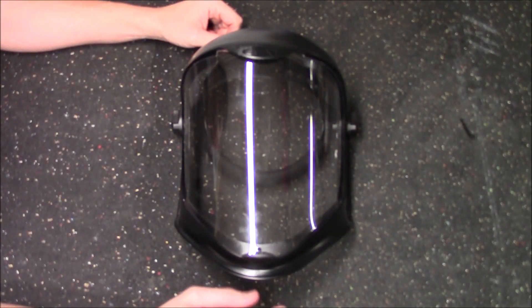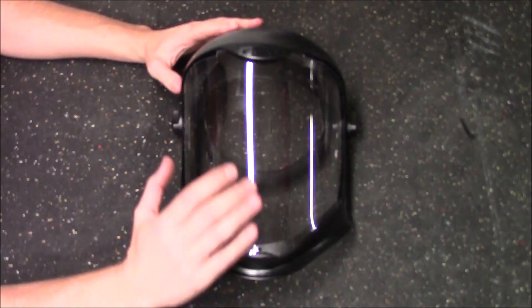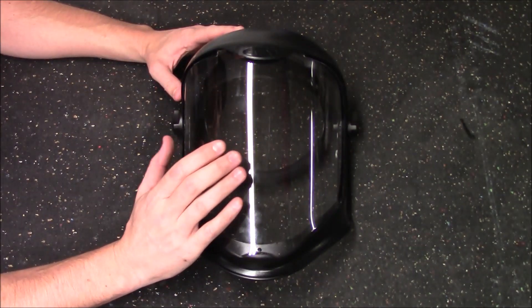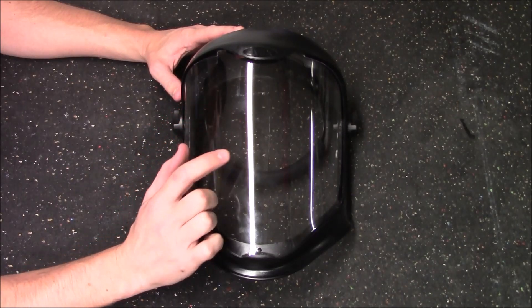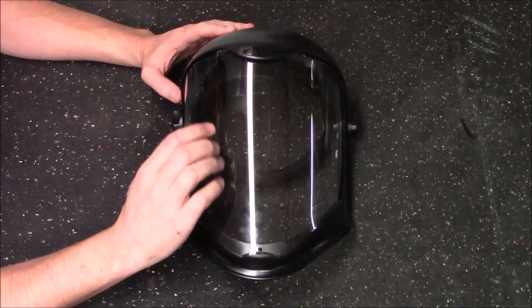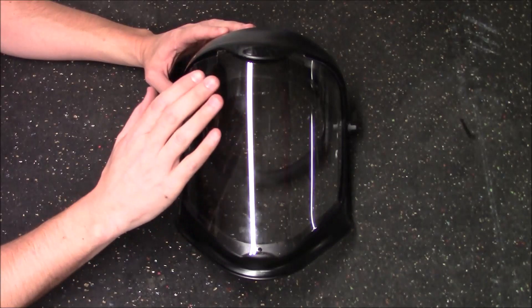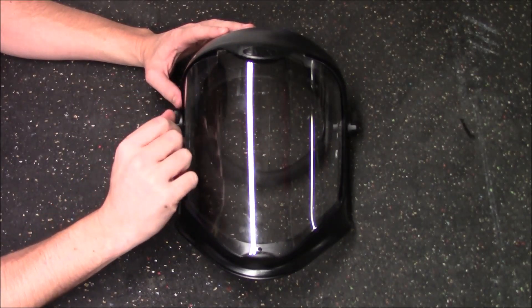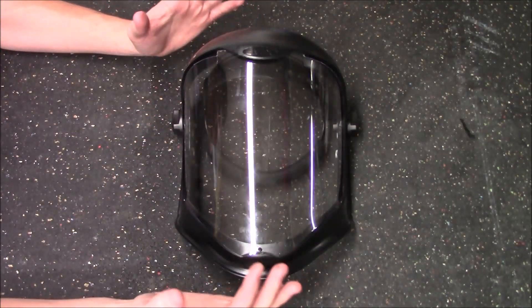Here's a closer look at the Bionic Shield. The clear lens you see is the standard lens that comes with it. However, when you first take it out of the package, it's going to look blue. That's because there is a protective film on both sides of the lens to prevent scratching during shipping. When you take it out and the lens looks blue, you need to remove it from the face shield and pull the film off both sides. Once you do that, pop it back into place and it will look exactly like this.